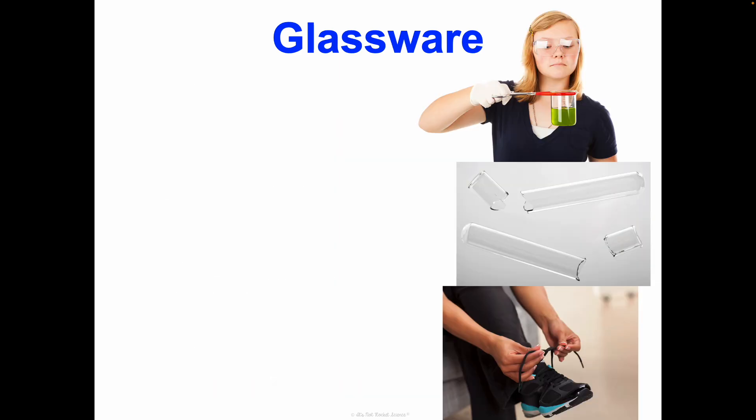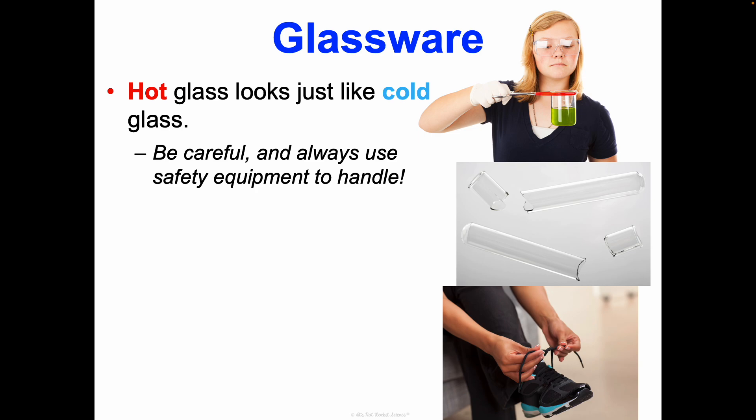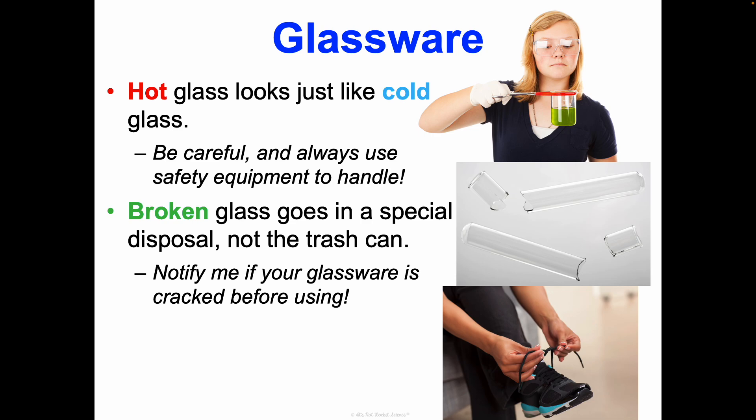A few things about glassware: hot glass looks just like cold glass, so don't ever just grab a beaker. You may not realize it's hot, and then you'll drop it, it shatters, and we're dealing with broken glass. Always use safety equipment to handle it — like using beaker tongs to pick it up. Broken glass always has to go in a special disposal, not the trash can. Also, if you see cracked glassware, let me know before you use it. I'll find other glassware for you, because cracked glassware that gets heated will shatter, and it could also leak out the chemical.